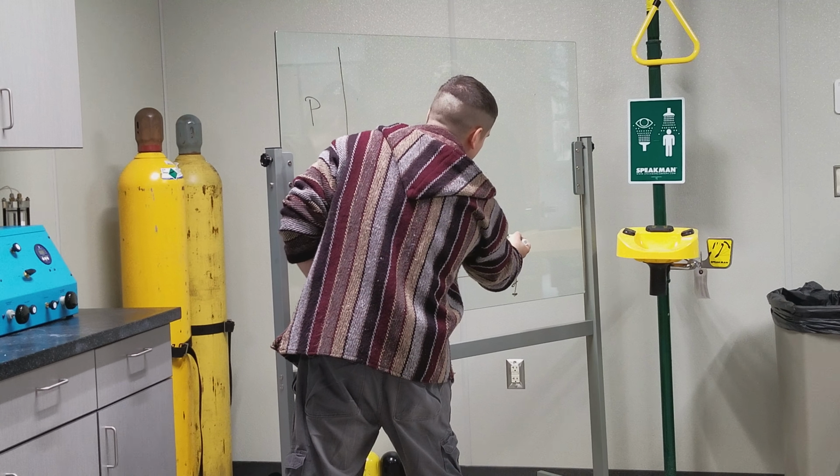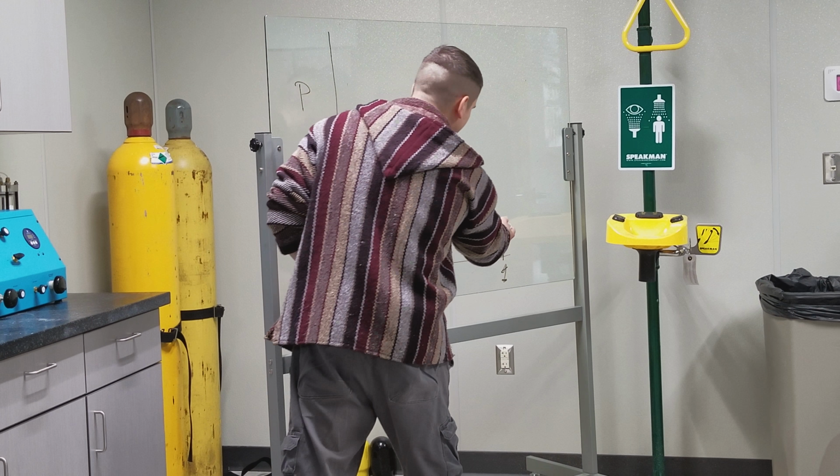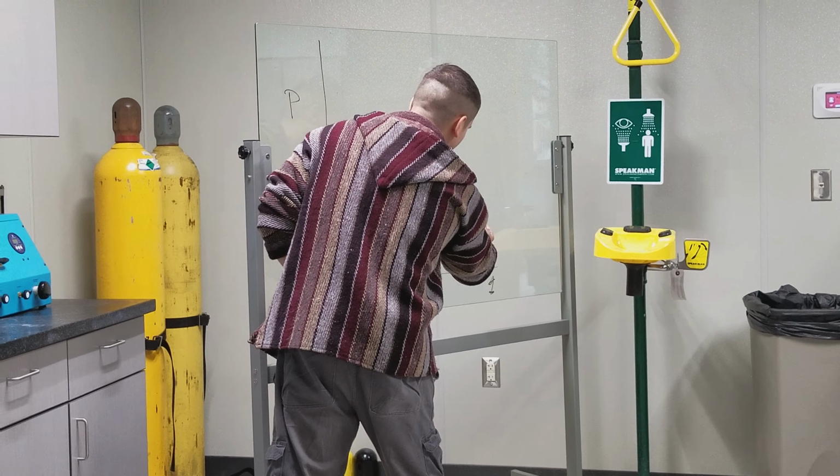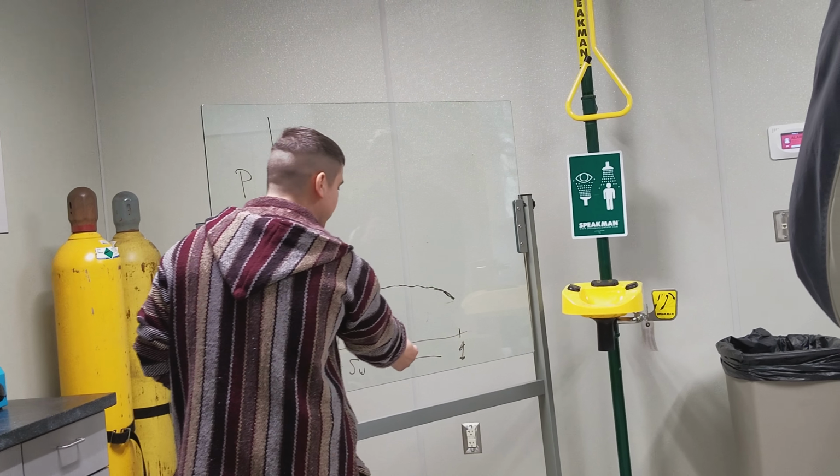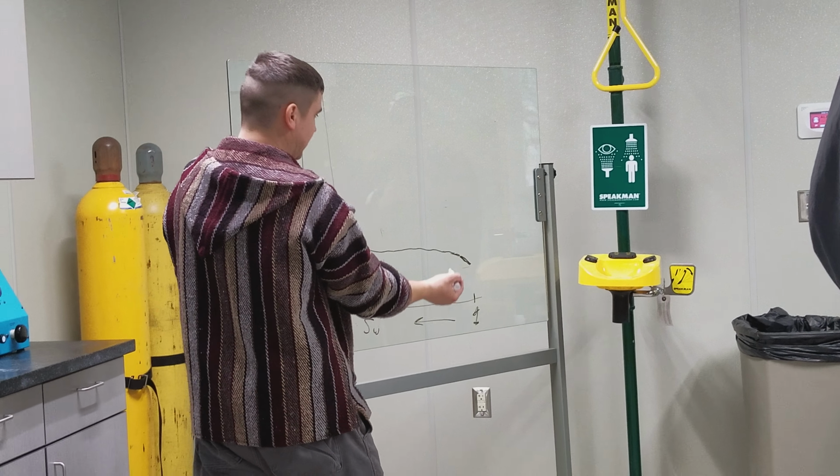You will have entry pressure for gas to enter the core sample, and then it will behave depending on the rock sample and the nature of the rock. It will behave in this way. This is the shape that ideally you will get in a nice porous and permeable core sample. What does this physically mean? In this direction, what do we have? We have 100% water saturation there. What happens when you start expelling water? Water saturation decreases, right? So it's lower and lower and lower because you're expelling water.